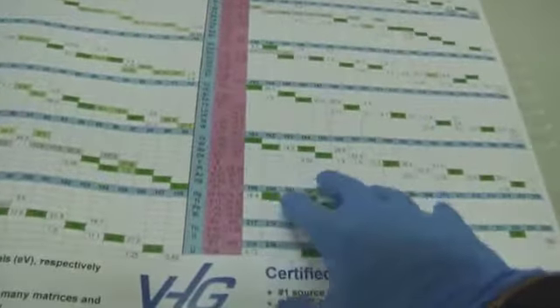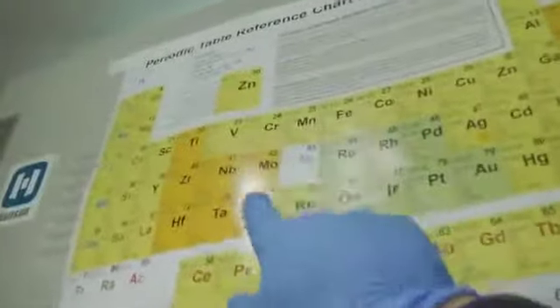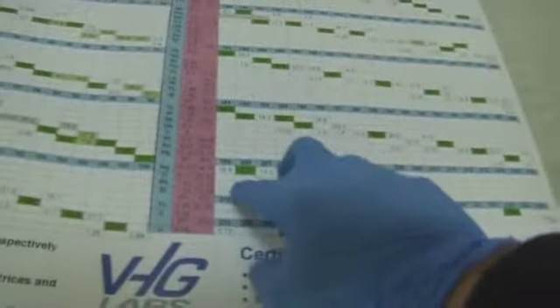So this is some of the big secrets right here, and I wanted to explain this because I'm the only person in the history of food science research that has ever discovered tungsten in rice protein powders. And some people scoffed at it, said, yeah, you must be making this up. It can't be true. How could you have come up with this? Well, this is how. Tungsten and mercury atomic masses, isotopes 184 and 186 plus 16 from the oxides equal 200 and 202.